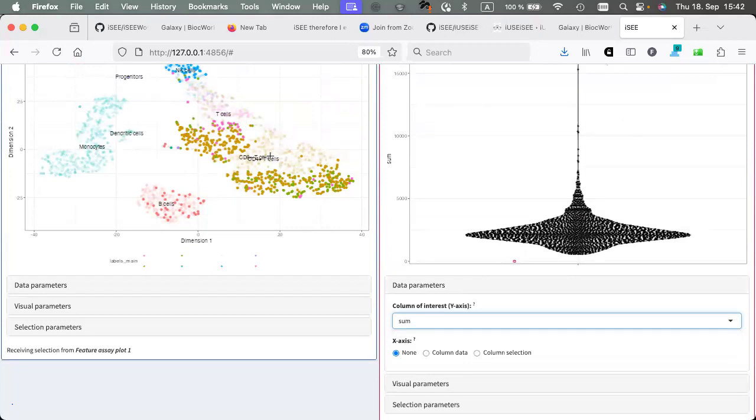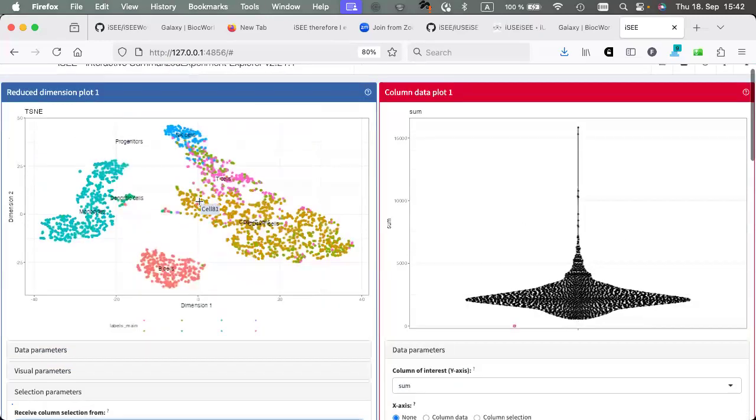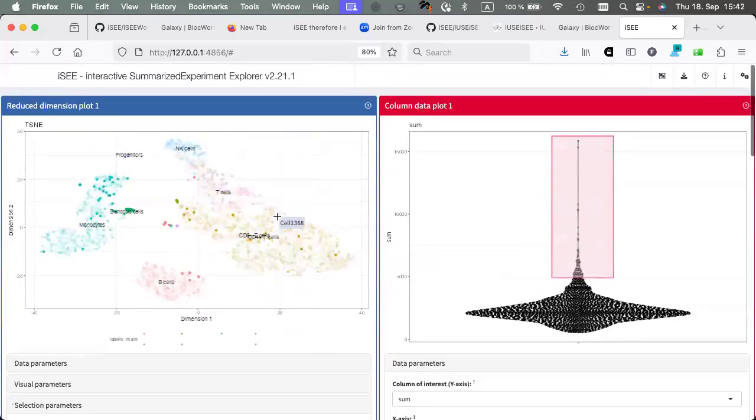What you can then do here, let's imagine that we are not taking any selection anymore, at least not from this one here. So we already have our t-SNE plot. We already have assigned some cell type, but you might want to see where are the cells that have most reads. So you just select them here, and you can pass it on there, and then you can see that they might be, let's say, a little bit sparse around. So let's select the ones on the lower end.